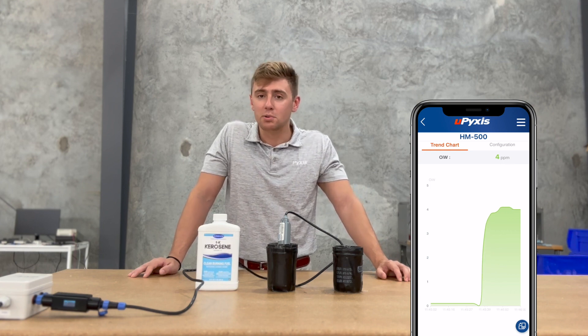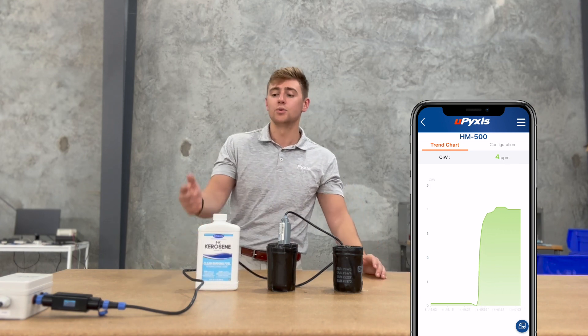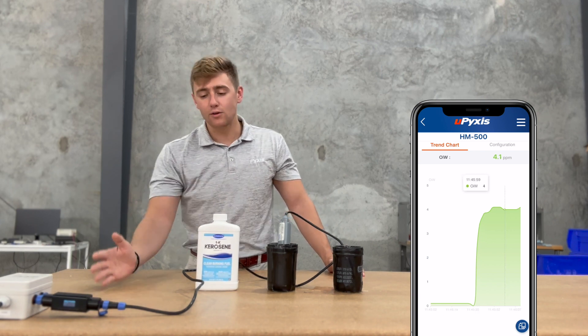So the sensor itself is super easy to monitor, super easy to get situated with the MAWB and a power source.